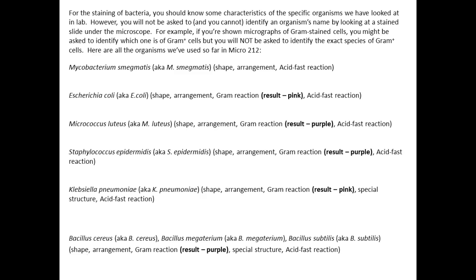Escherichia coli, or E. coli for short, you guys remember the shape? Rod, bacillus. Does it form a characteristic arrangement? Do they stay next to each other in chains or pairs? No, they're what we call single. They're all by themselves.